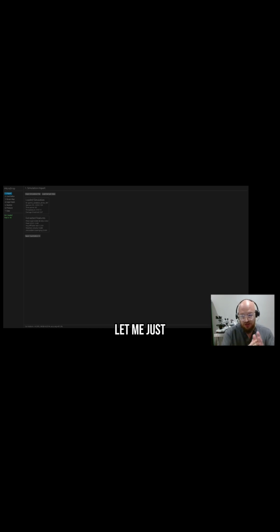Okay, first off, let me orient you to this section here, which is the simulation import. The backend is written completely in Rust, 100% in Rust, because I'm a Rust dev, amongst other things. I'll go through a quick walkthrough so you can see what the application is about.